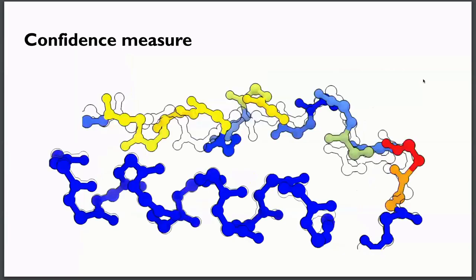And so you can think that at each update, the model that was initialized kind of randomly slowly starts refining. And ModelAngelo also predicts a confidence measure for each residue, which is based on how much it predicts the model is going to be wrong compared to the deposited model. And this is also coming from the node features, as well as probably the most important, which is the amino acid probabilities for each residue, right? Because again, we don't know what residue types exist until ModelAngelo has predicted them.